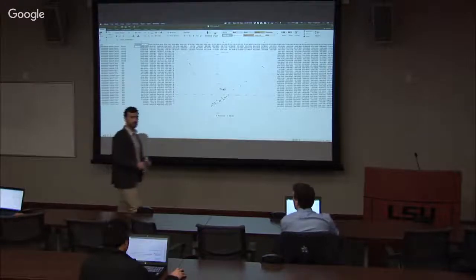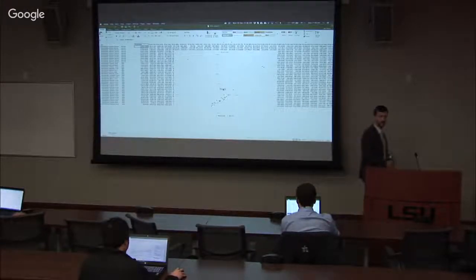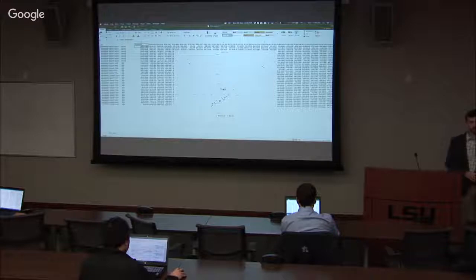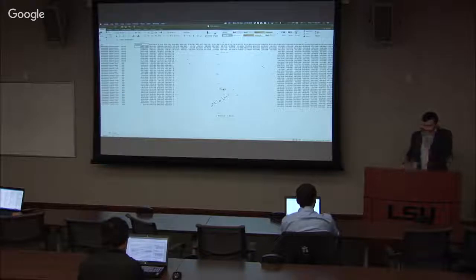In the utilities-based PCA analysis, there's a parameter for transforming our table to logarithmic scale. If you do quantile analysis and you do a logarithmic transformation there, you should turn off that option, correct? Right. When we did it here, we didn't, so that's why I was asking. Okay, yeah, you shouldn't do that. But let's take a look at the results.